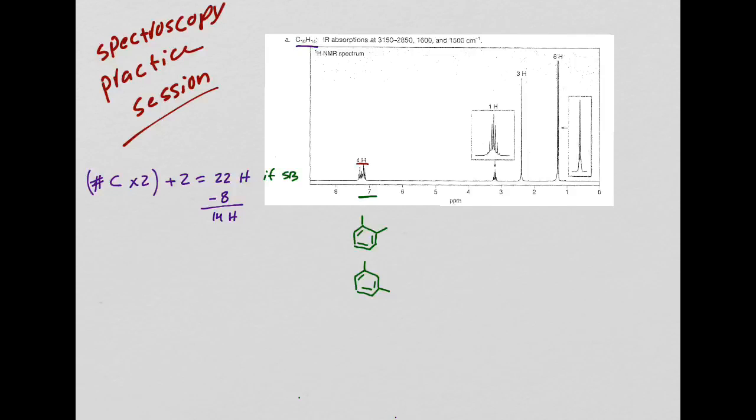Now let's go to the next peak. The next peak is at 3 ppm, 3.1, 3.2 ppm. It's kind of downfield, right? But we know we don't have any oxygen or nitrogen, but we know that we have a benzene ring, which is also electron withdrawing. Okay, so that's kind of expected. So I have a peak at about 3.2 ppm. Now, when you look at the integration, it only has 1 hydrogen. That's interesting. Okay. Now, how about the pattern? The pattern looks like a mess, but when we zoom in, there's a nice pattern going on. 1, 2, 3, 4, 5. I have a pentet.